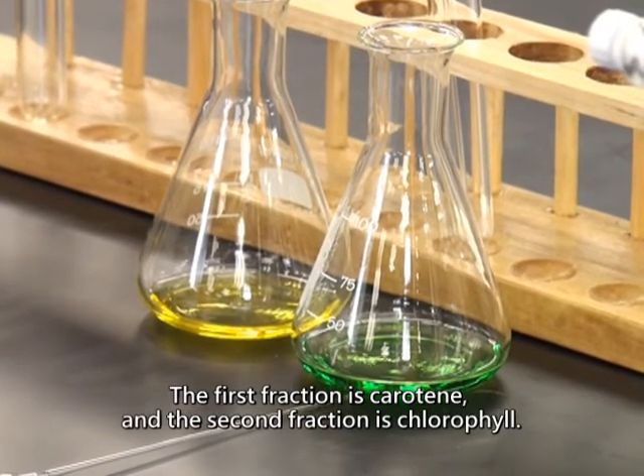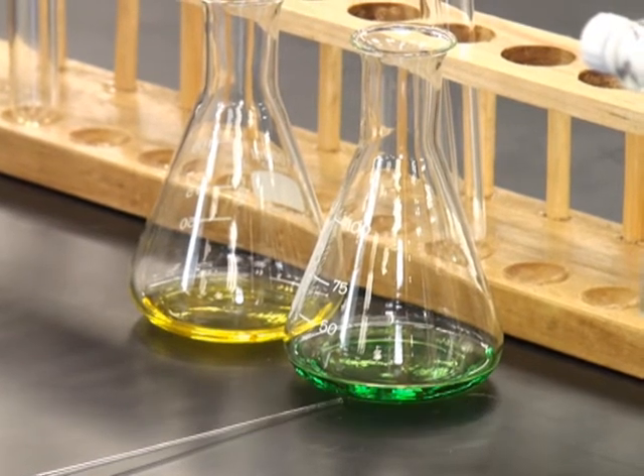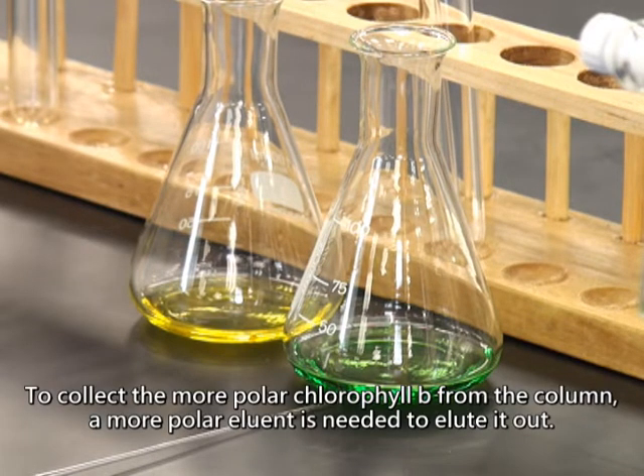The first fraction is carotene and the second fraction is chlorophyll. The green fraction collected is chlorophyll A. To collect the more polar chlorophyll B from the column, a more polar eluant is needed to elute it out.